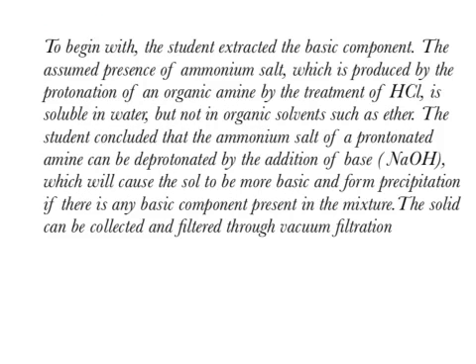To begin with, the student extracted the basic component. The assumed ammonium salt, which is produced by the protonation of an organic amine by treatment with HCl, is soluble in water but not in organic solvents such as ether. The student concluded that the ammonium salt of a protonated amine can be deprotonated by the addition of a base, such as sodium hydroxide, which will make the solution more basic and form a precipitate if there is any basic component present in the mixture. The solid can be collected by vacuum filtration.